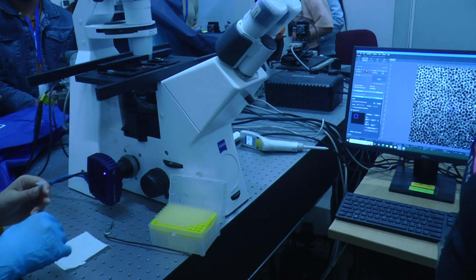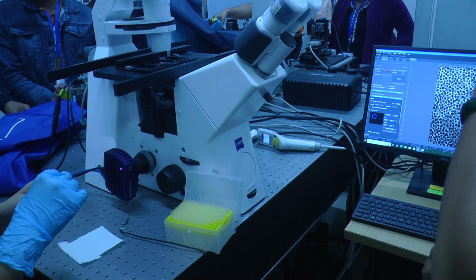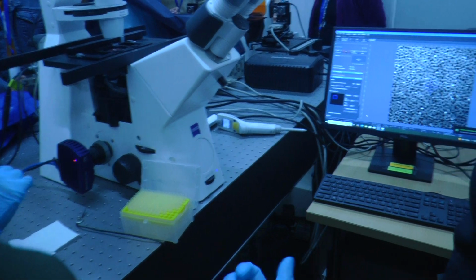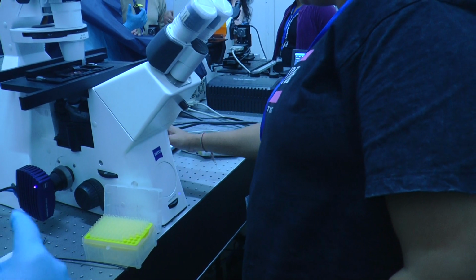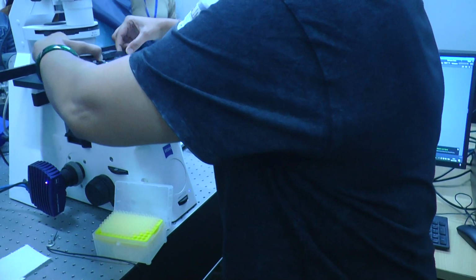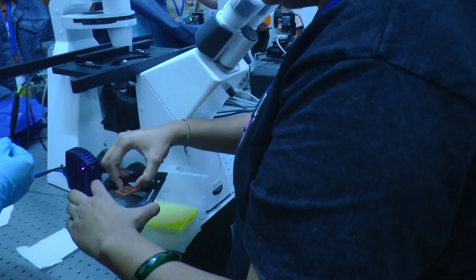But he has put a lot of blood, due to which it's all compact. In normal blood the concentration is less than this. Not the concentration of NaCl, but the concentration of red blood cells. Yes, because the blood concentration is a lot in this.